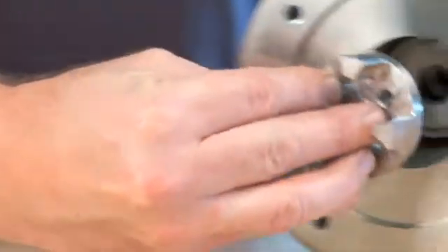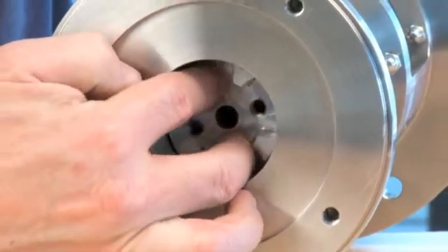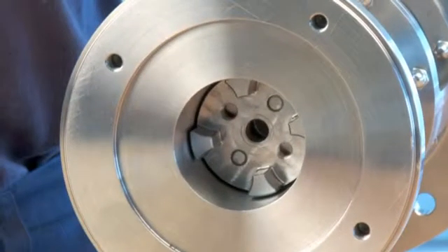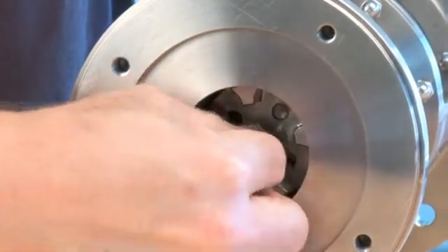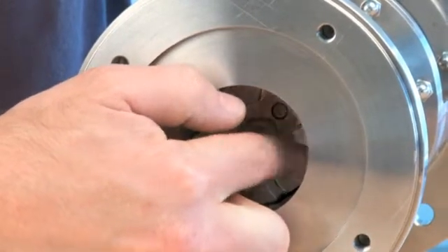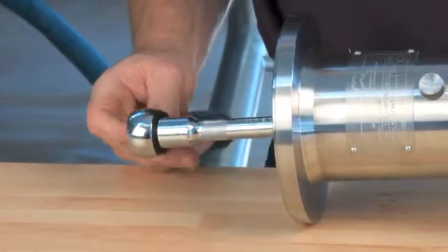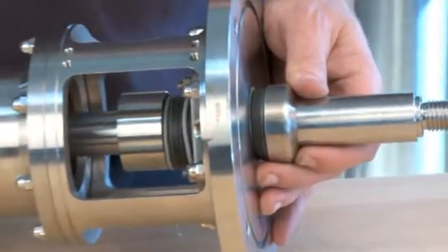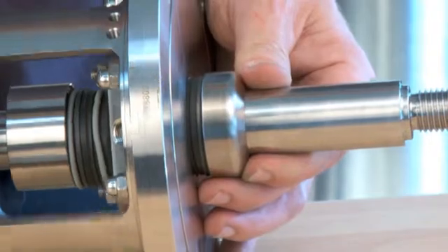Mount the coupling correctly on the pins. Mount the shaft bolt. Tighten the shaft bolt while checking that the seal and O-rings slide into proper position.